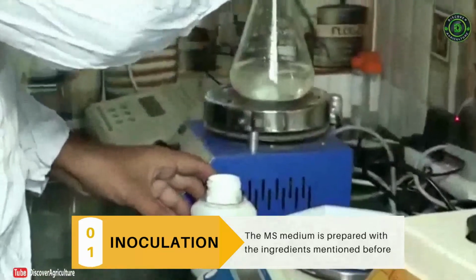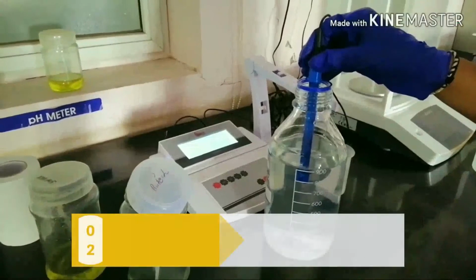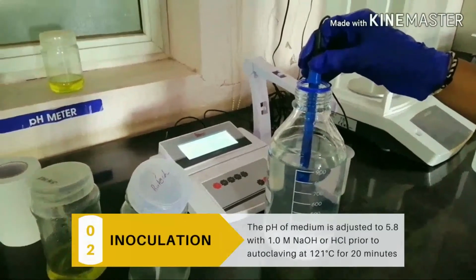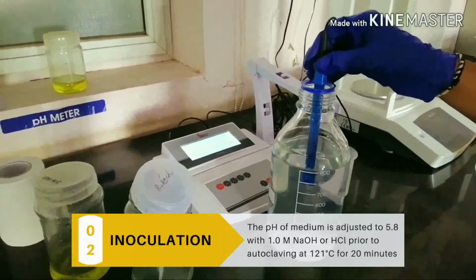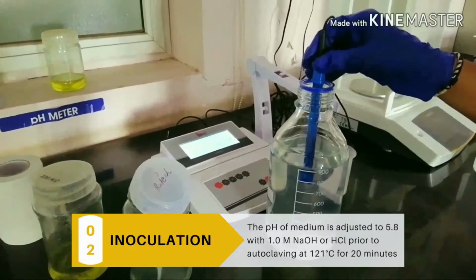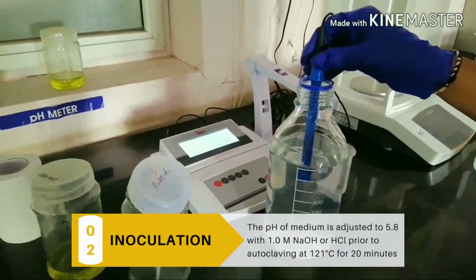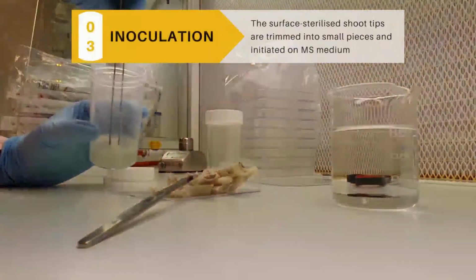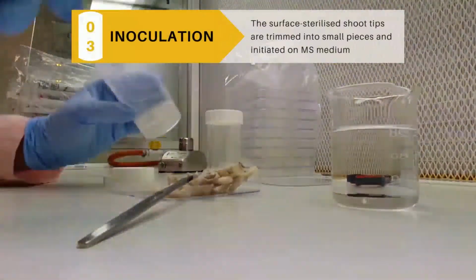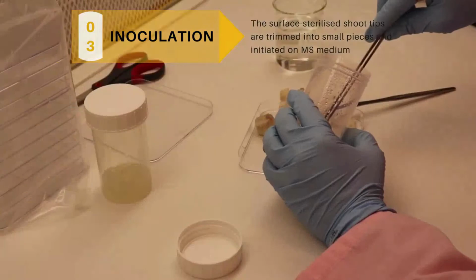Perform all procedures under a surface sterilized laminar flow hood. The pH of the medium is adjusted to 5.8 with 1.0 molar sodium hydroxide or hydrochloric acid prior to autoclaving at 121 Celsius for 20 minutes at 100 kPa. The surface sterilized shoot tips are trimmed and placed on full-strength Murashige and Skoog medium.